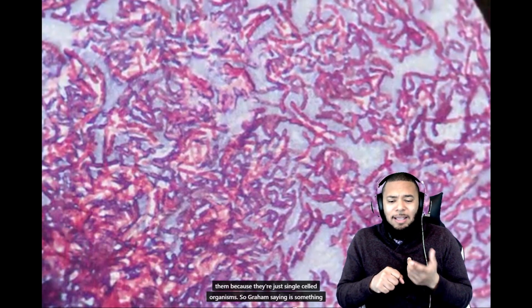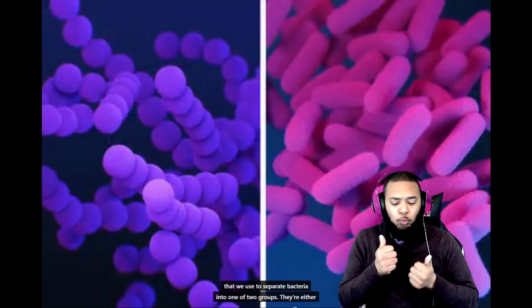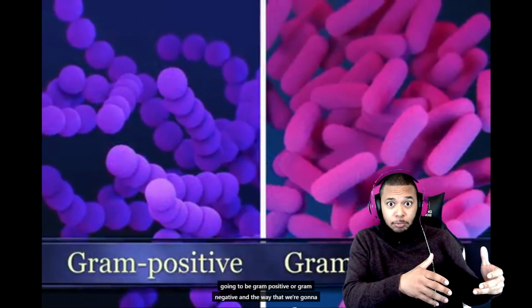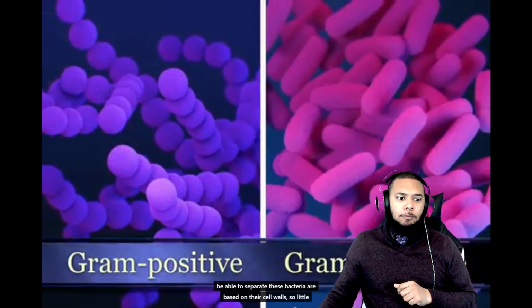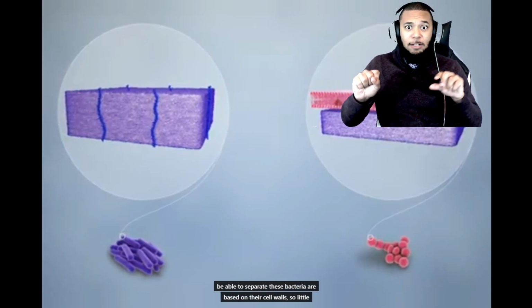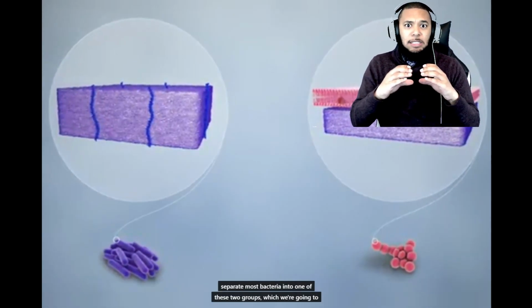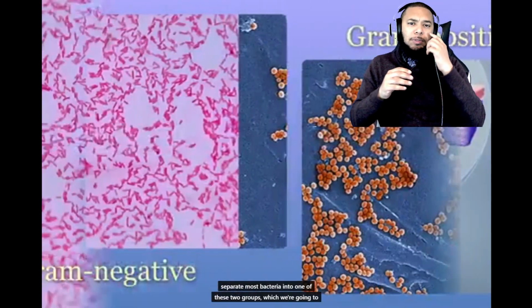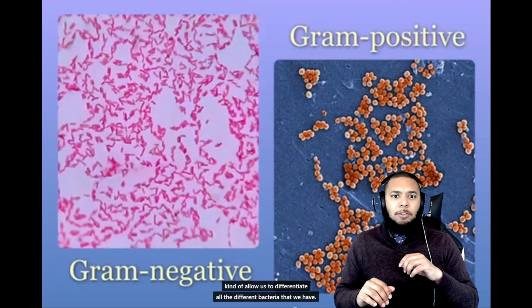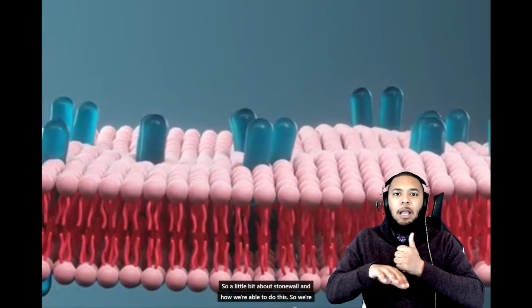So gram staining is something that we use to separate bacteria into one of two groups. They're either going to be gram positive or gram negative. The way that we're able to separate these bacteria is based on their cell walls. There's a little bit different structure within their cell walls, and that allows us to separate most bacteria into one of these two groups, which is going to allow us to differentiate all the different bacteria that we have. So a little bit about the cell wall and how we're able to do this.